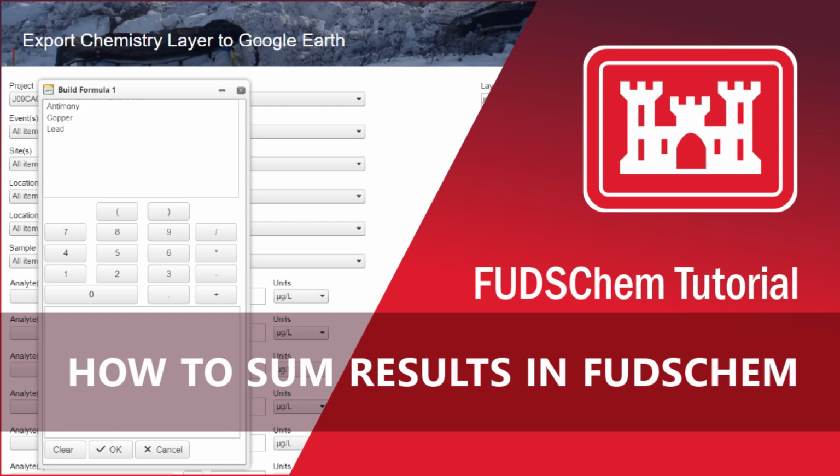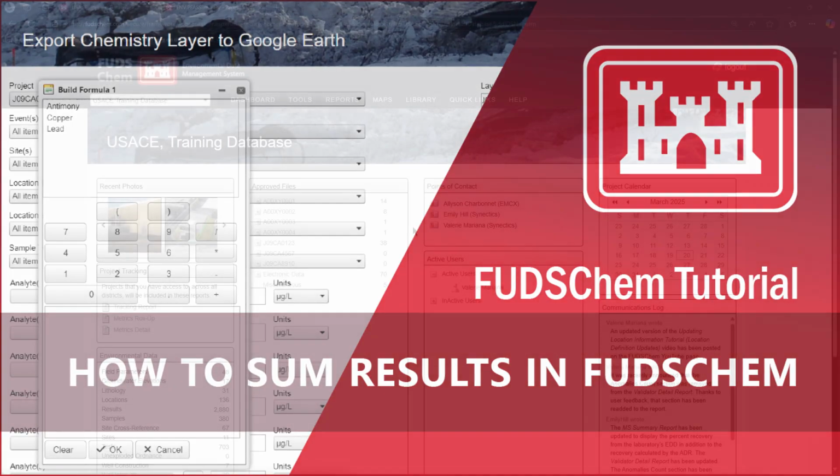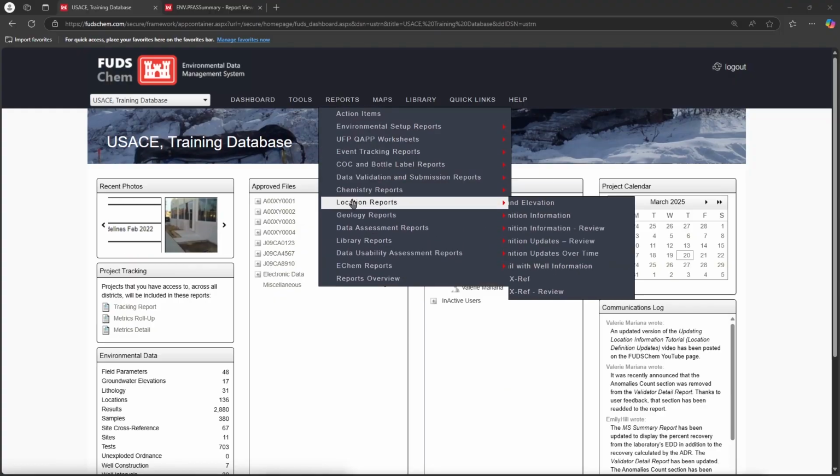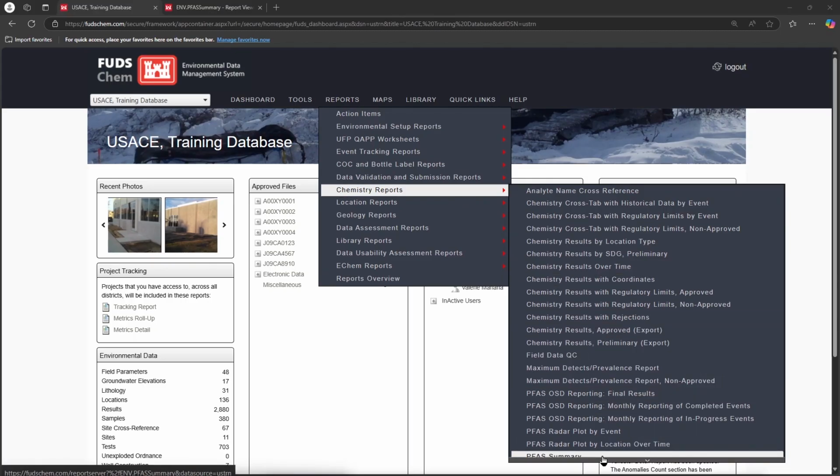This video will go over how to sum results in FUDSChem. This includes using reports and Google Earth functionality to sum PFAS and non-PFAS results. First, we'll go to Reports, Chemistry Reports, and choose PFAS Summary.